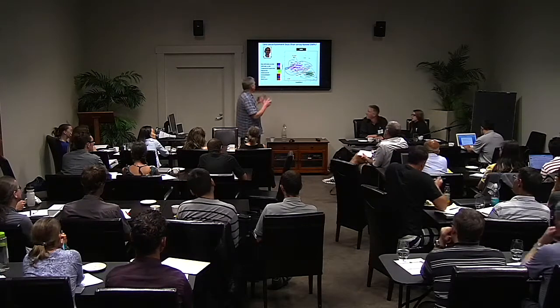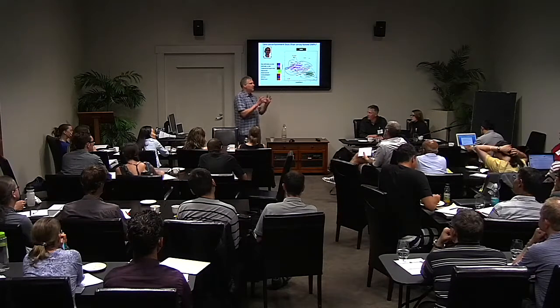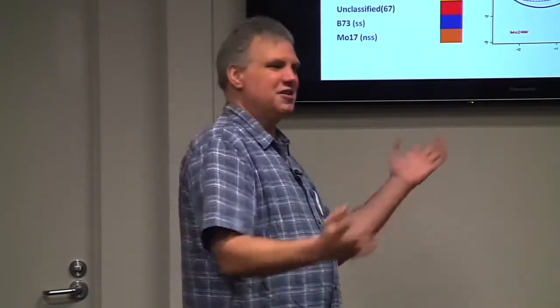We're kind of doing these talks out of the usual order. We normally go through the pipeline first. So in the pipeline, we have a discovery pipeline and then a production pipeline. And we do these periodic discoveries in Maize where we use all the samples we have of Maize. We throw everything in and we discover the SNPs. So that's what we advocate, and that'll get the least amount of ascertainment bias.